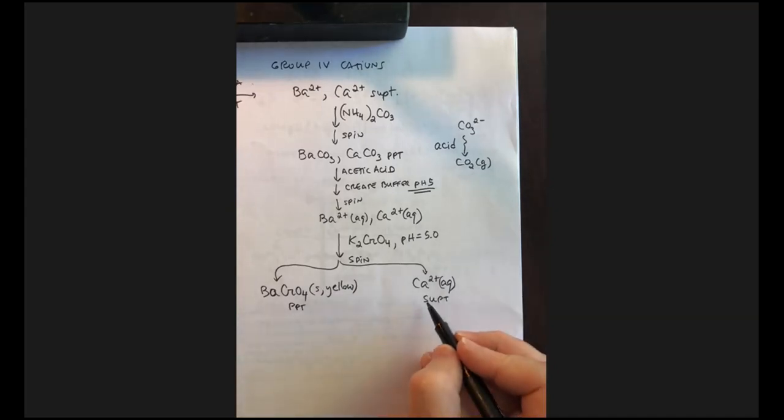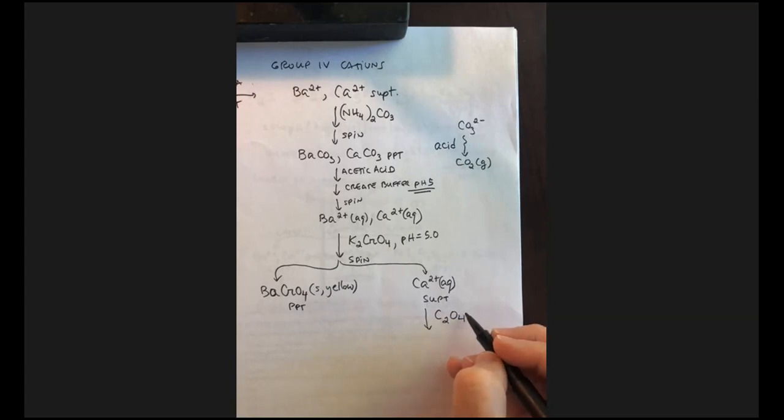At this point, the calcium is going to be in the supernatant. So what the procedure asks you to do is you're going to be adding oxalate ions. And that is going to produce in here a calcium oxalate precipitate that has a white color.